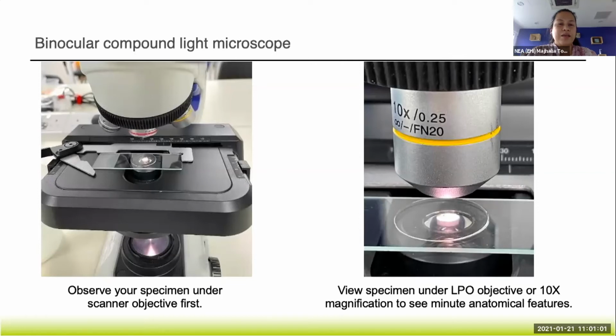Usually we don't examine all, but if you just have a few samples, best to examine all. But we have developed a criteria for examining samples. We always check for different colors. That's why we pour in the bowl. We check for different colors of the larvae. So darker ones, lighter ones, different sizes, some small, some big.